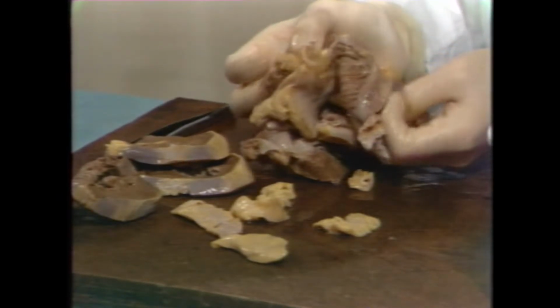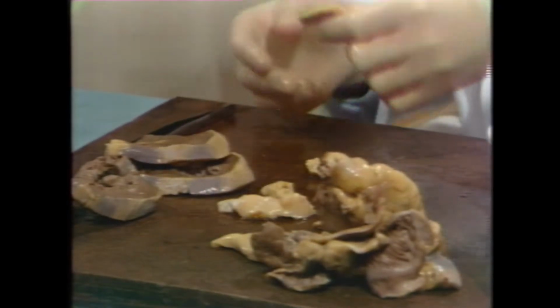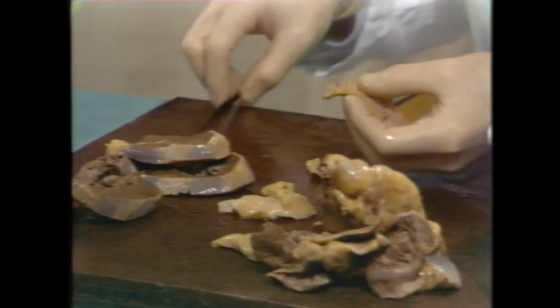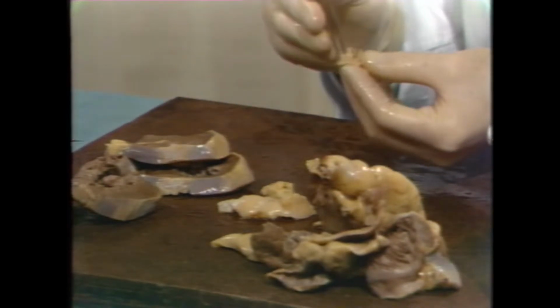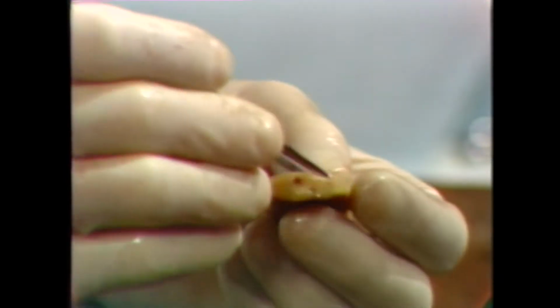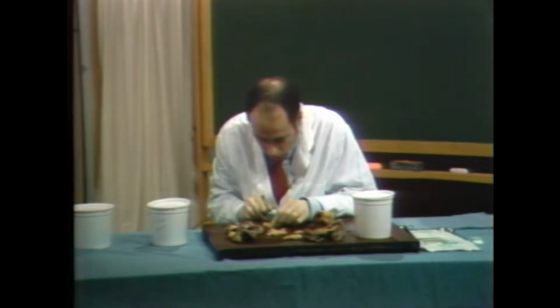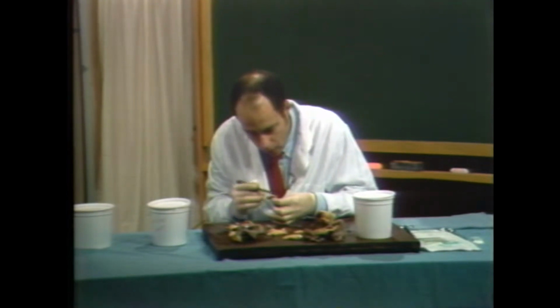The coronary arteries have been taken off the heart, I presume intact, and that is an excellent way to examine the coronary arteries. This is the way that I like to do it at any rate. Now, how much luminal narrowing? Many of these arteries the lumens are quite wide open.